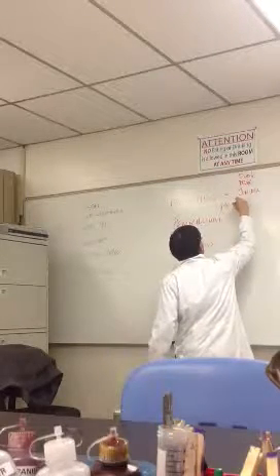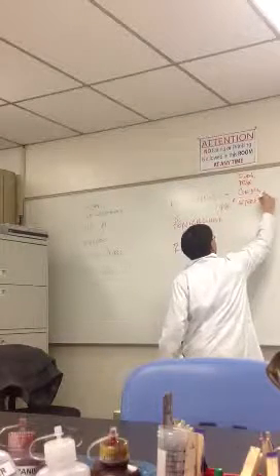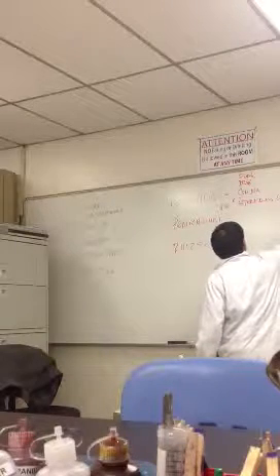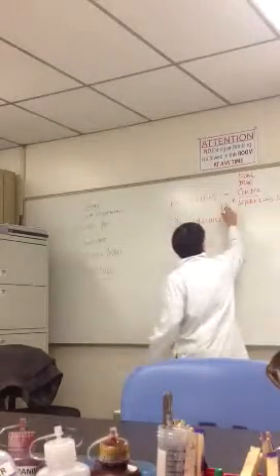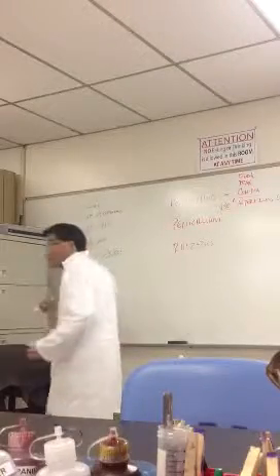So you want to use the Aspergillus conidiophores. That's the slide you want to use. All right. That will show you the structure that you're looking for. Okay. So you want to make sure you do that. All right. Any questions about that?